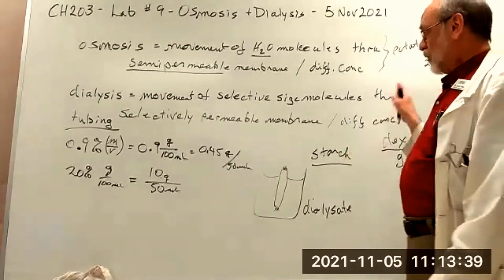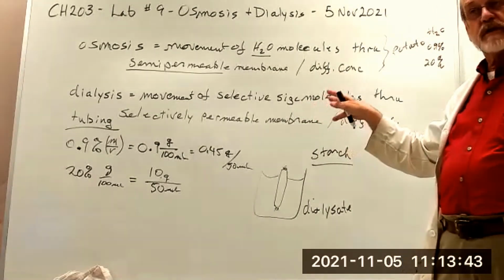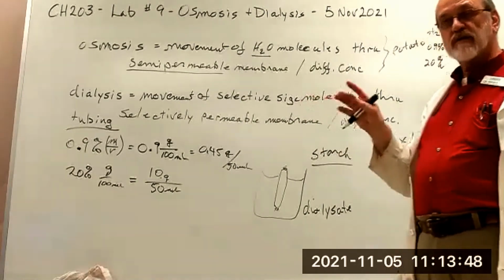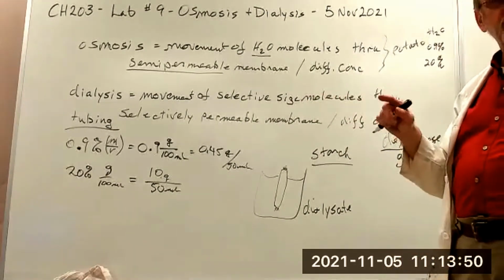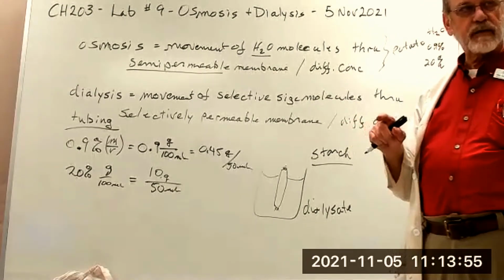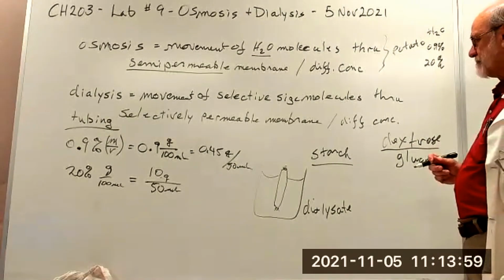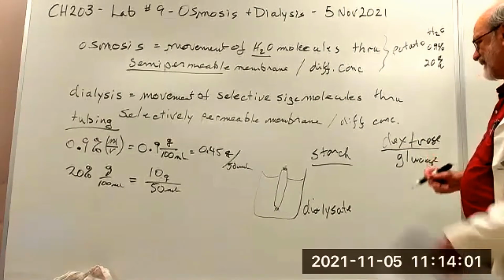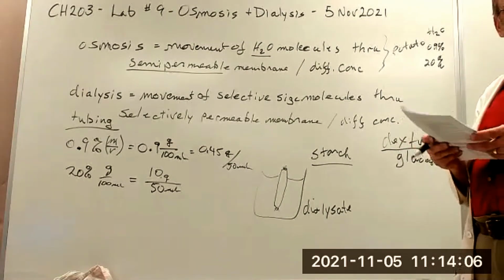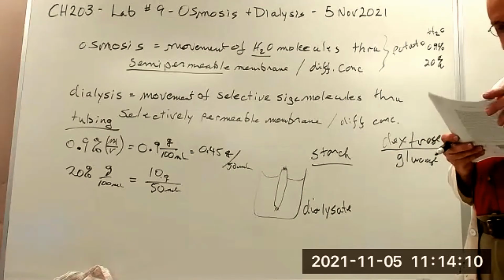Actually, we're basing this on size alone, but dialysis tubing comes in a whole host of molecular structures, and it can be very selective, not just on size, but on polarity of the molecules. Or you can look it up. Just regurgitate the answer from the internet.